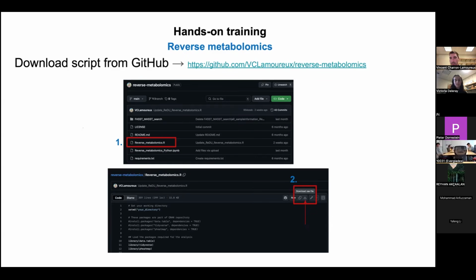Now just to recap, in the chat William just posted the folder that contains all the tables that you're going to need for today's workshop on the R environment. Then you have the script that was provided by Shipe and Victoria. In the folder that you just downloaded, there will be the Pan ReDU metadata, that is the TSV file called all sample information. And inside that folder, you're going to have the input fast search file, the one that we just did together for histidine C4, phenylalanine C4, and the phenylalanine cholic acid. This will be used for our directory in RStudio, which we're going to walk you through in a second.